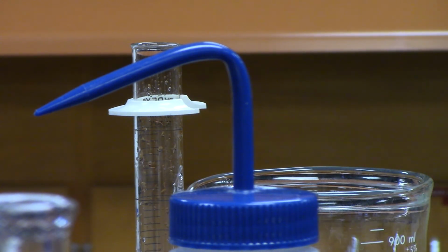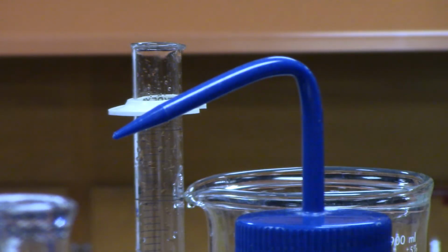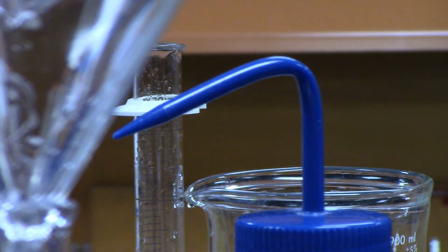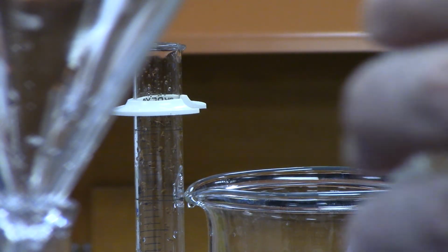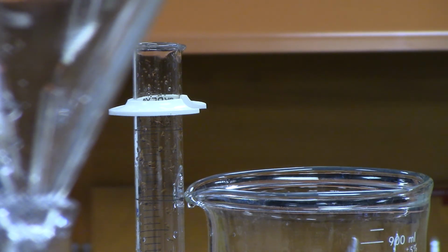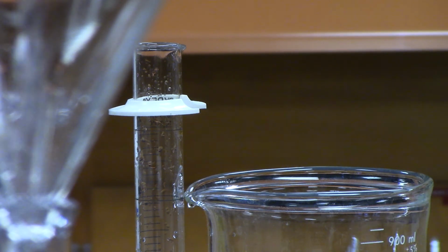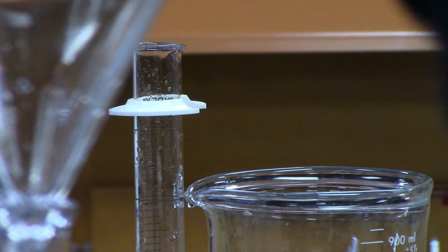I want to rinse out my, actually I should leave my funnel on there. Rinse out my beaker. I'm going to do it 4 times. When I first started doing lab, they told me to do it 7 times, but I'm going to only do it 4. Something magic about 7.